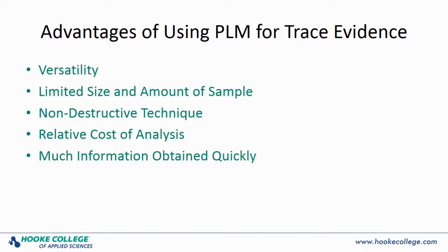Due to the time constraints, the techniques discussed in this presentation will not be described in complete detail. However, hopefully what you learn today will demonstrate the value of microscopical techniques and how powerful the polarized light microscope can be in solving trace evidence problems and identifying unknown particles.